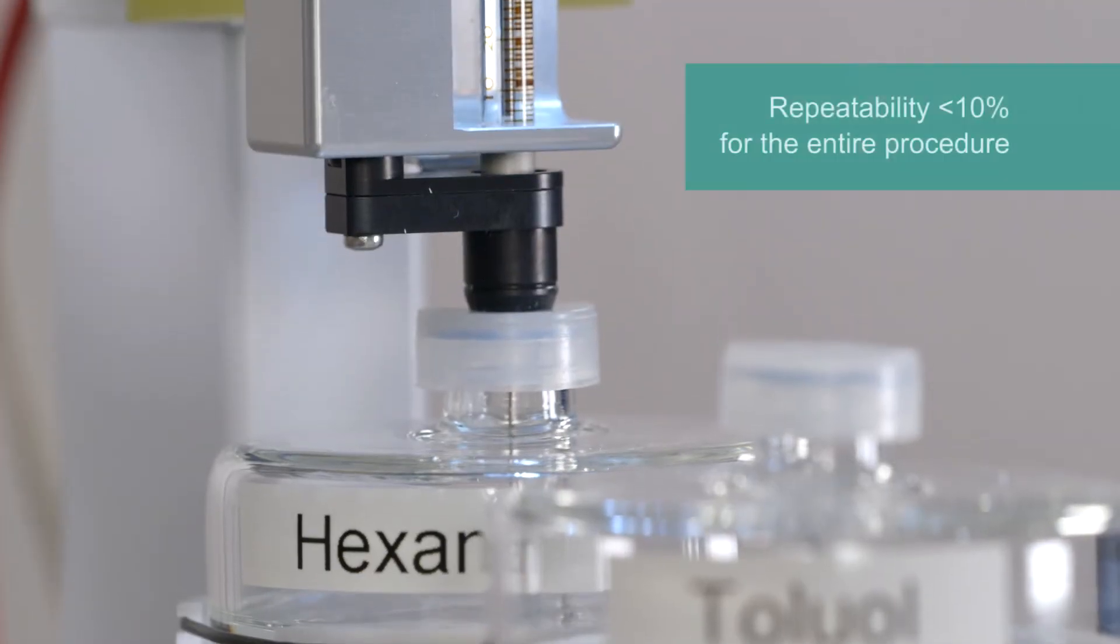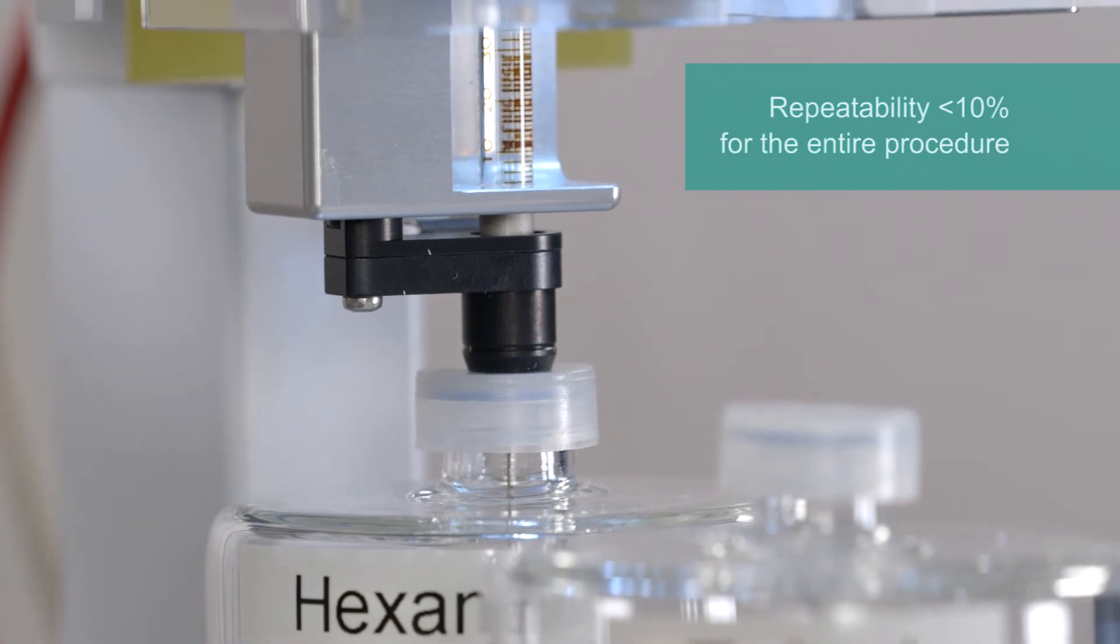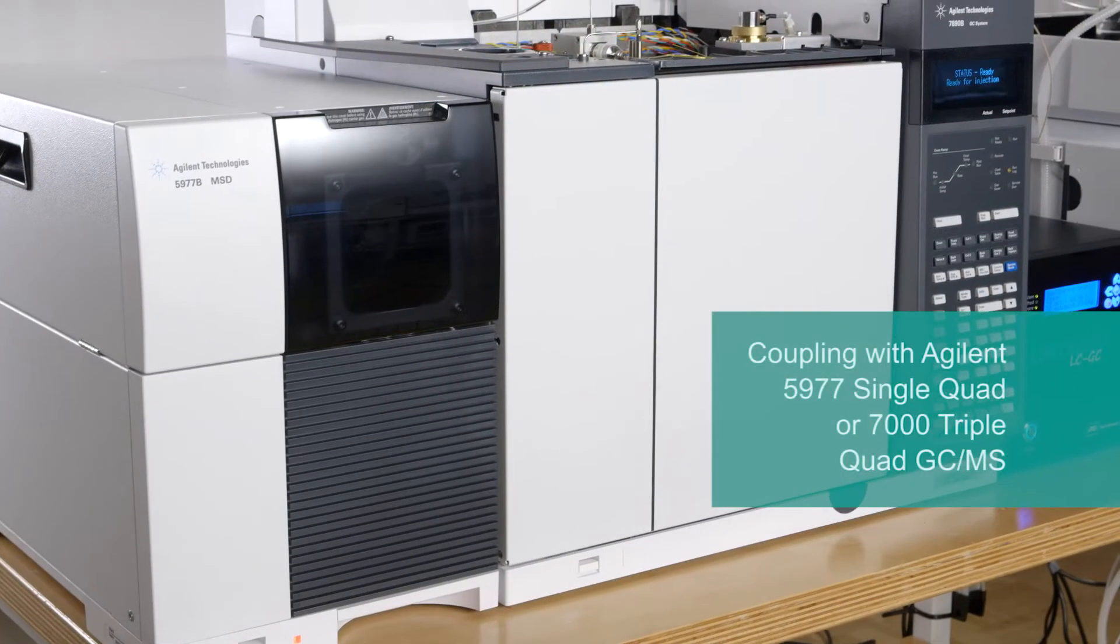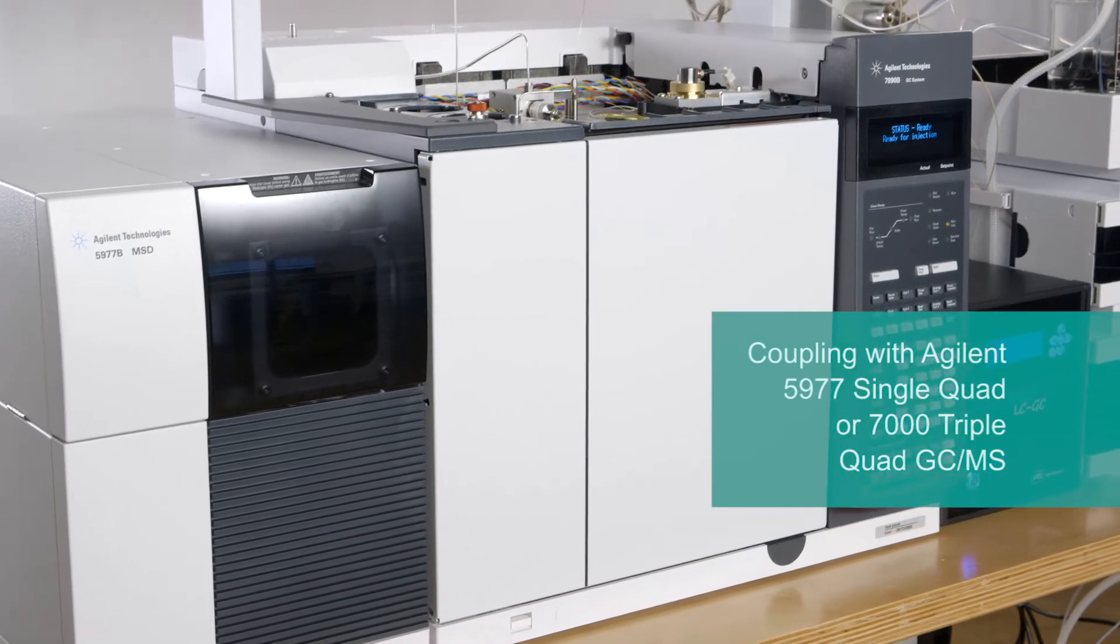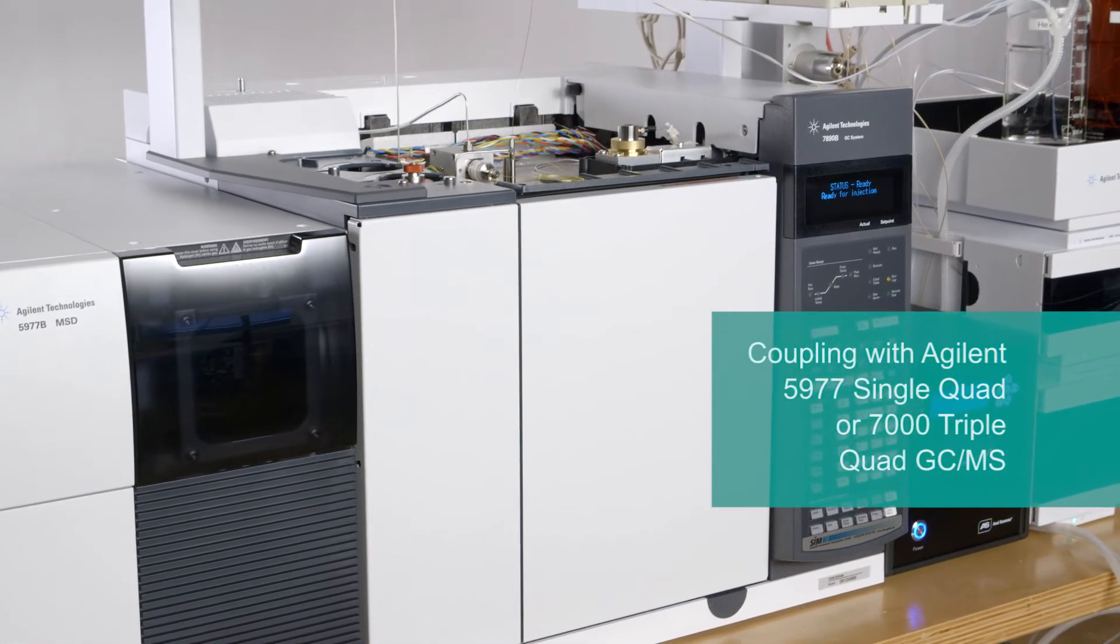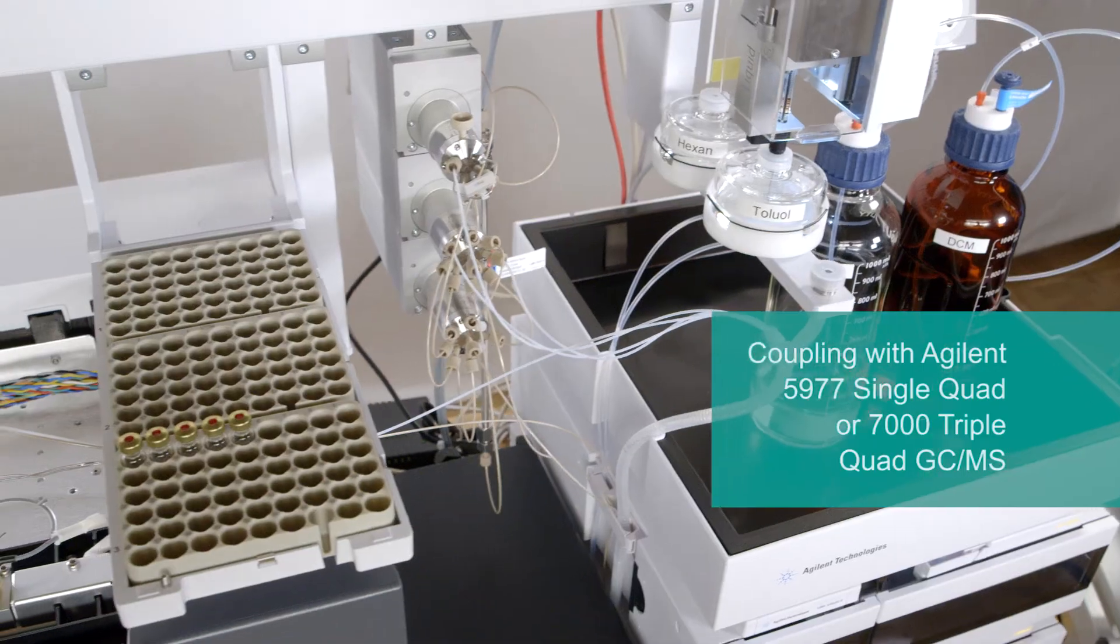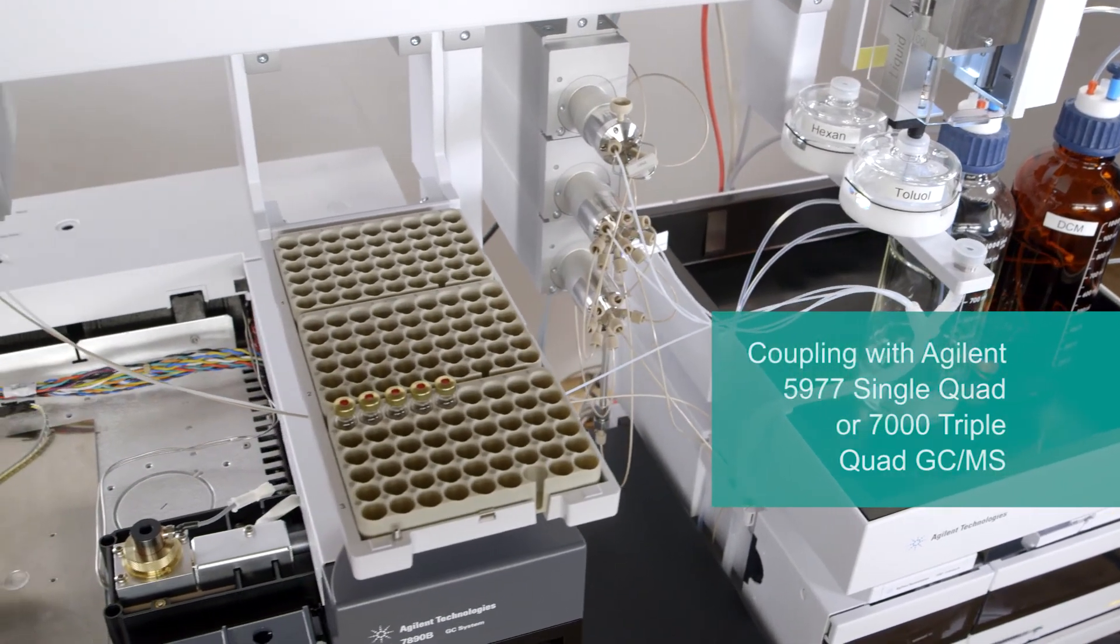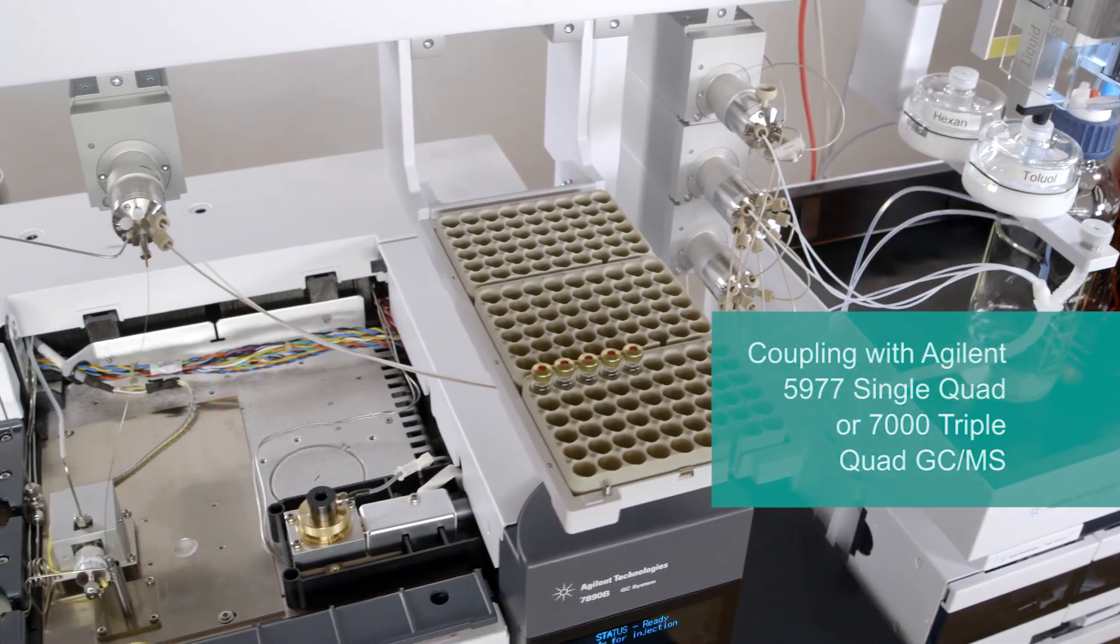Excellent reproducibility is guaranteed. The PAH analyzer uses the IMPACT technology for an improved utilization of your lab. In addition, you get very sensitive and reliable results when you combine it with the Agilent technology's mass spectrometer.